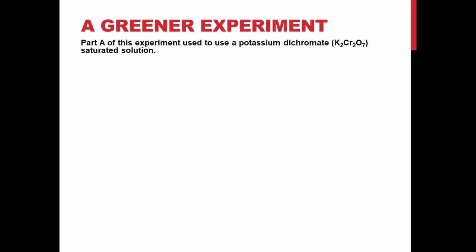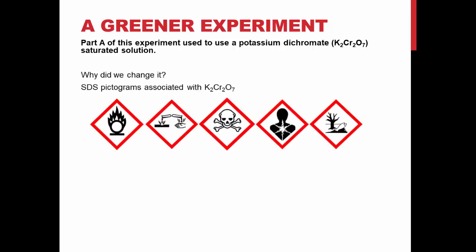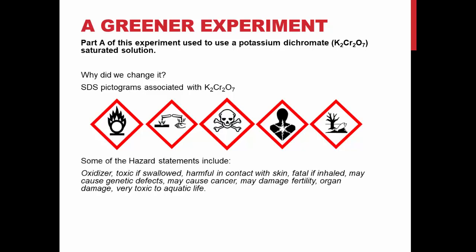Part A of this experiment used to use a saturated solution of potassium dichromate. It was changed for several reasons. Here are some of the pictograms associated with potassium dichromate. Some of the hazard statements include: oxidizer, toxic if swallowed, harmful in contact with skin, fatal if inhaled, may cause genetic defects, may cause cancer, may damage fertility, organ damage, and is very toxic to aquatic life. The safety comparison becomes clear when getting the SDS pictograms of sodium chloride — because there aren't any.